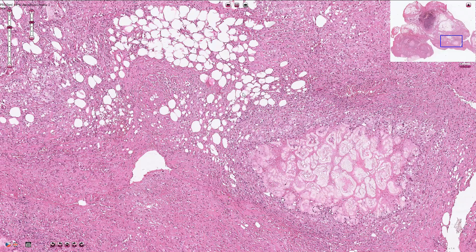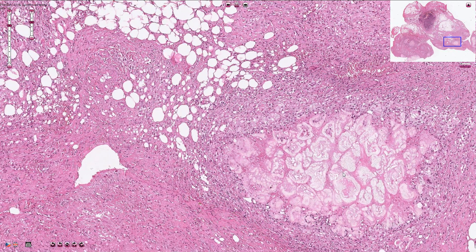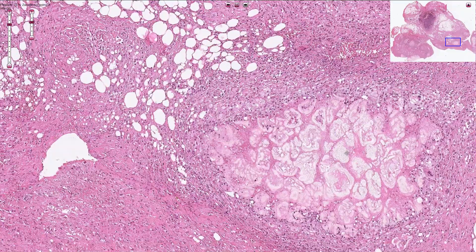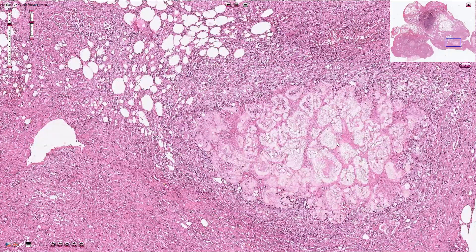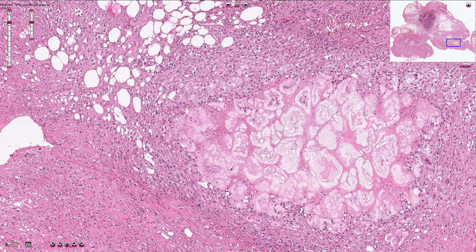Normal viable adipocytes have a clear empty cytoplasm, and fat necrosis looks like this amorphous, slightly eosinophilic tissue. Nuclei and the cytoplasmic membranes are lost, and we see only shadows of the cells.